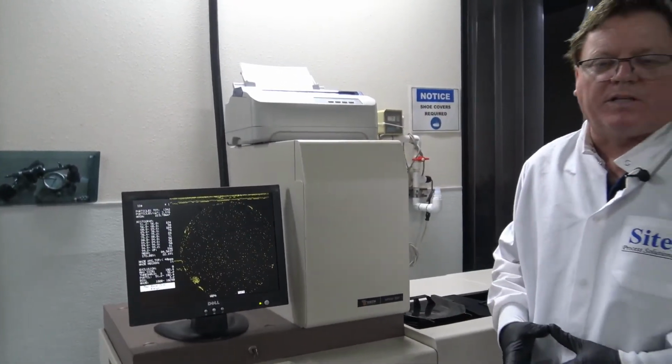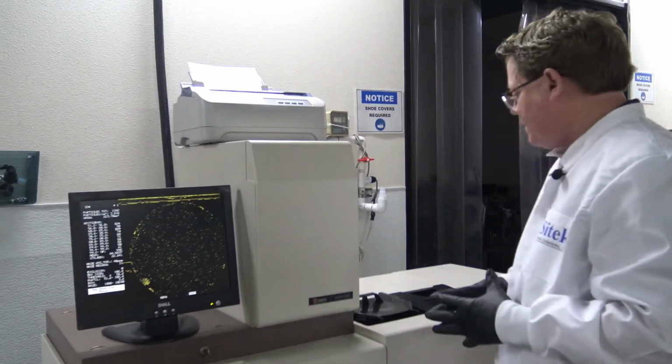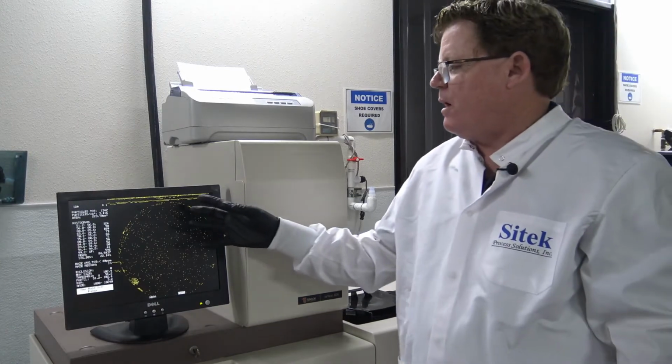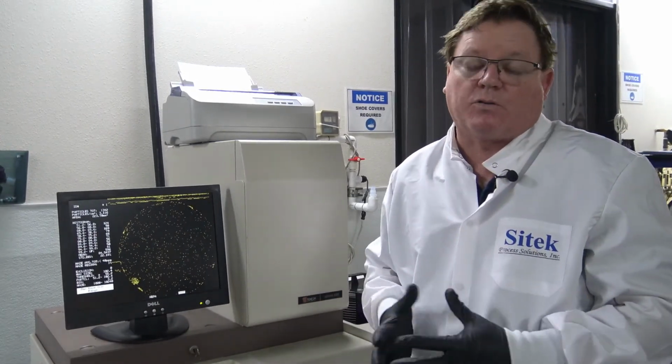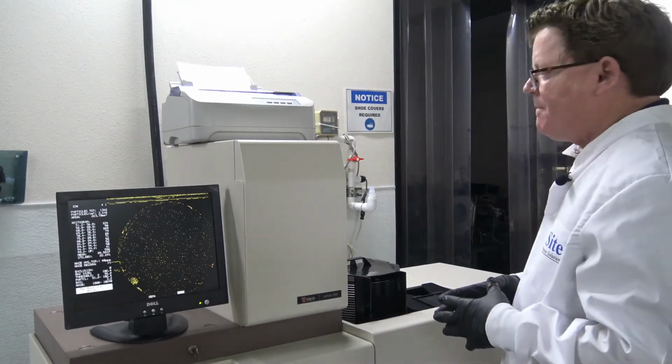So you can see it's repeatable in the sense that every minute particles are being added and they're continually going up like I expected. And that's what we've seen for the last 2 days in cycles. We've been running it from a prime wafer with no particles all the way up to about 10,000 or 12,000 particles, and then we keep switching brand new wafers at that point.